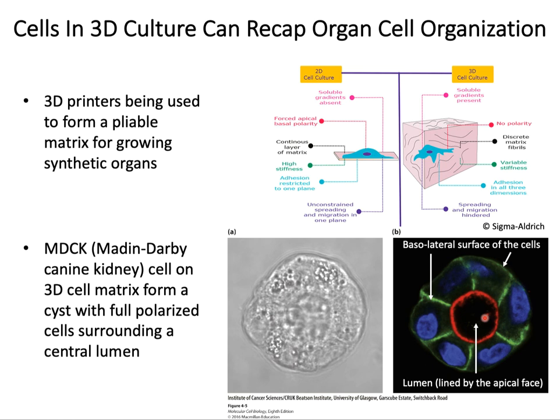On the other hand, the green dye or fluorophore is found on the lateral and the basal surface only and not on the apical surface. And you can see the distribution on the lateral side of the cells and the outer periphery, which is the basal surface of the tube in a cross section. The nuclei are stained blue with a DNA-specific dye, by the way.